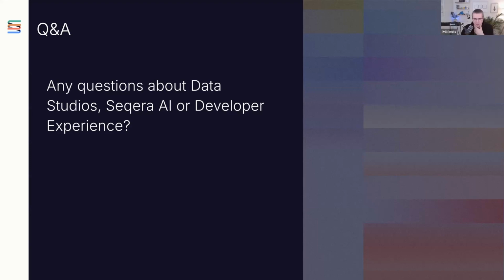Okay, last couple of questions because we're running out of time. There's a question here. Can the Seqera platform be installed on a local server? So Seqera platform is a commercial product, and you can either run the cloud instance, which is hosted by us, but there's also an enterprise version, which you can install on your own in-house infrastructure. So basically, yes, a local server. If you're interested in that, check out seqera.io, and on the product page, you can find more information and get in touch with us.